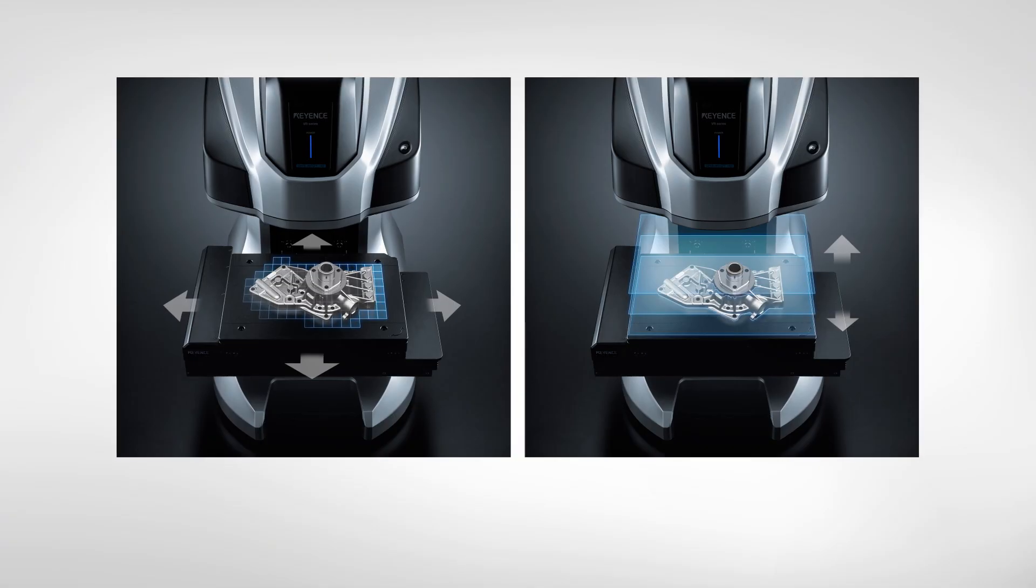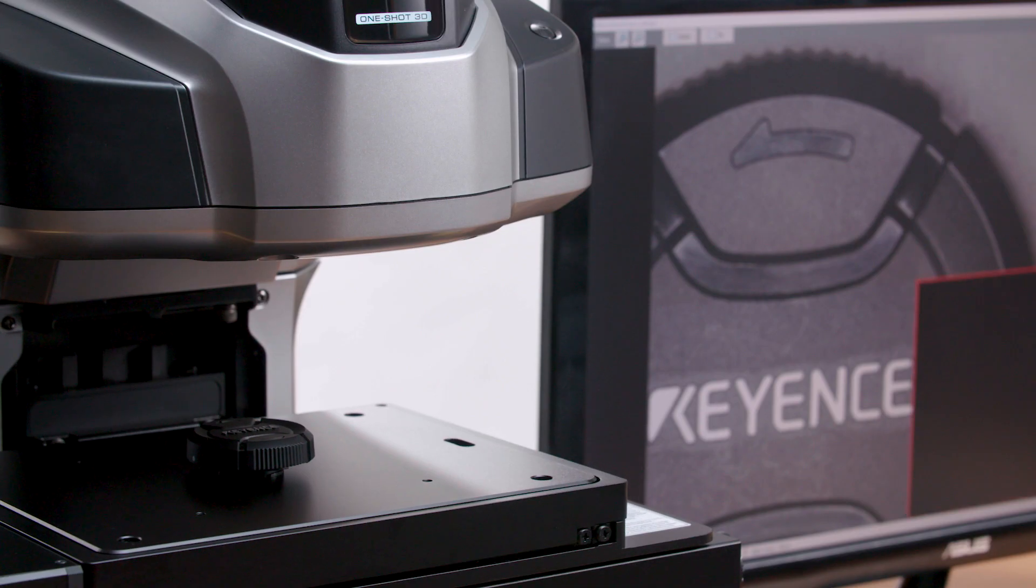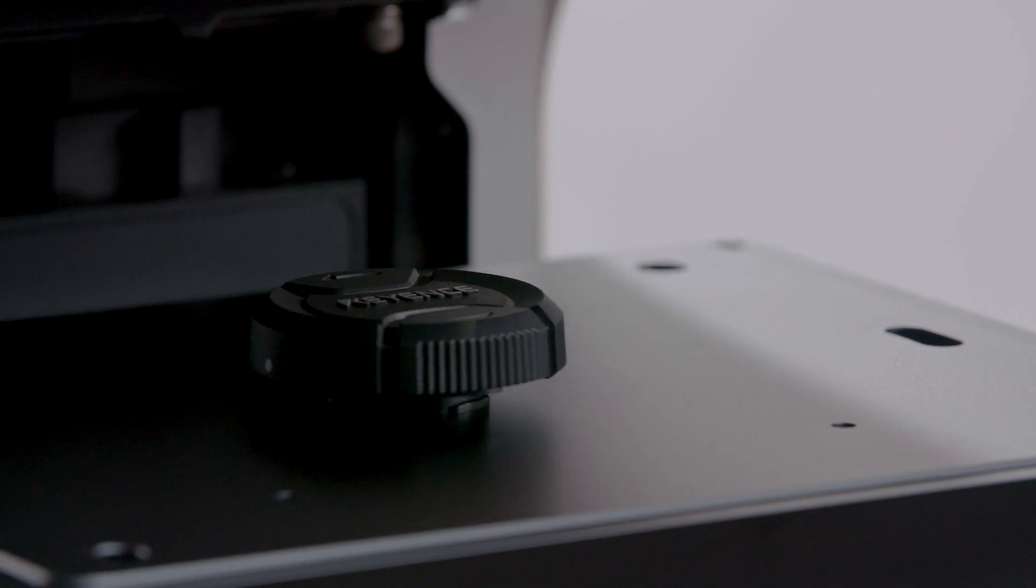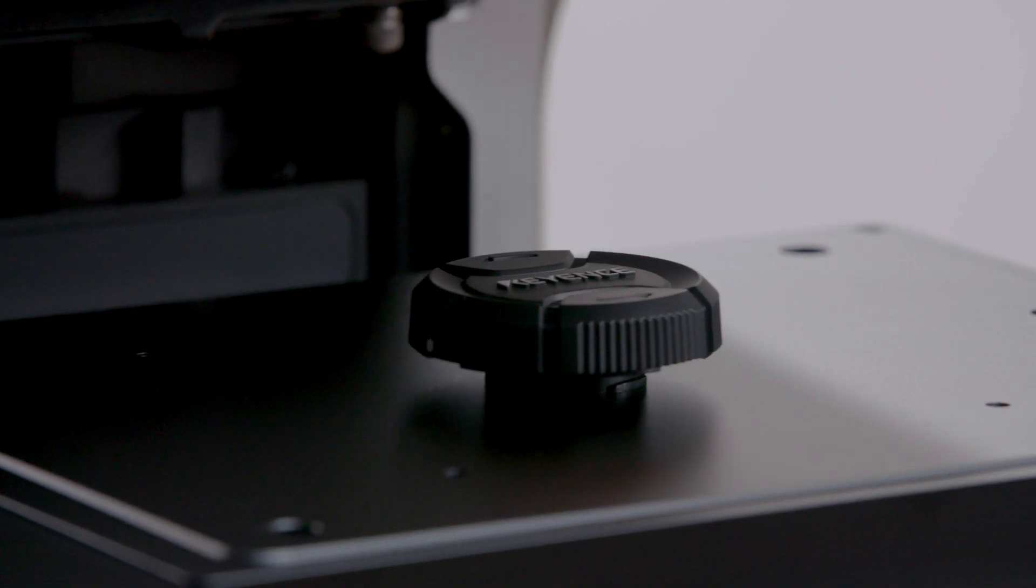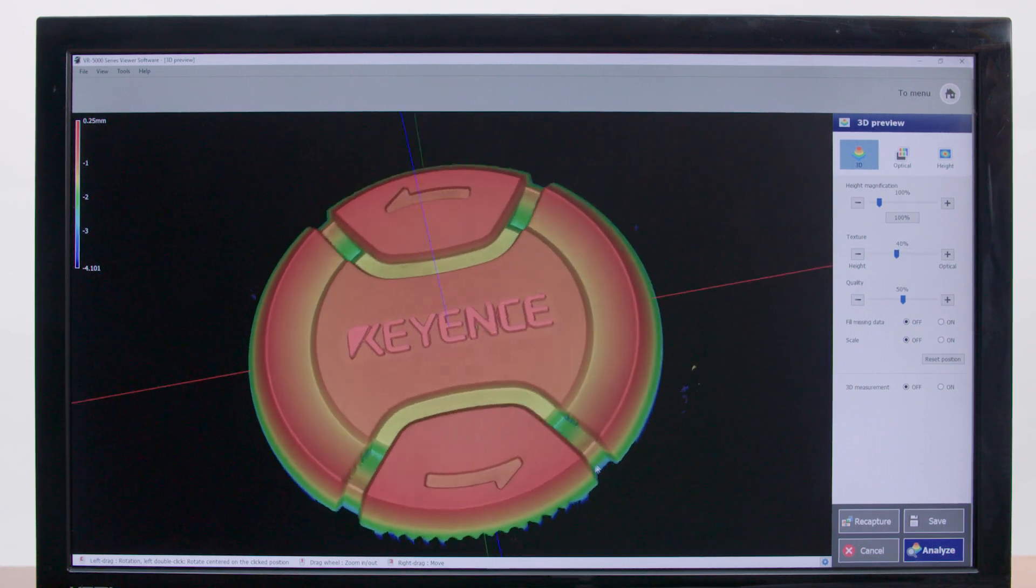The VR now incorporates smart measurement. This new feature automatically determines the location and size of a sample and optimizes lighting conditions with a single click. 200 mm x 100 mm x 50 mm parts can be measured quickly and easily without the need of a skilled operator.